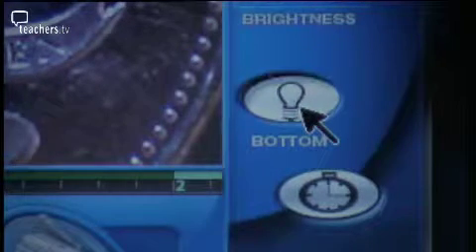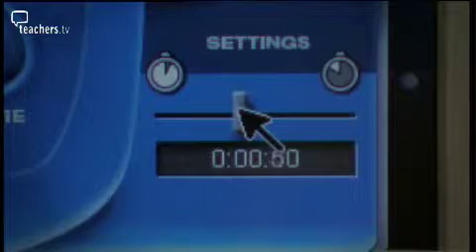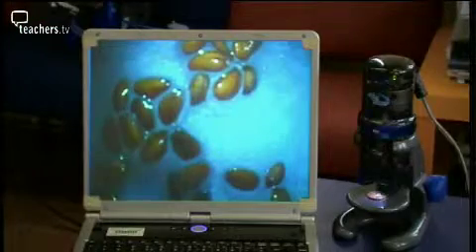Okay. There are different makes of microscope on the market, but they all do pretty much the same thing. You can capture snapshots at regular intervals, which can then be run together to make a time-lapse film. For the life cycles topic, Avril is hoping to follow the germination of cress seeds. But will there be time for the seeds to germinate overnight?